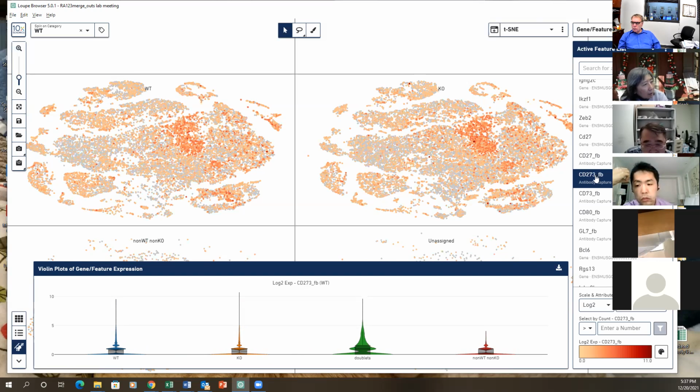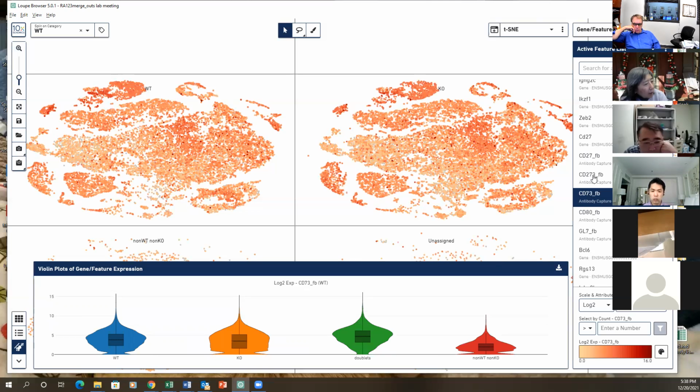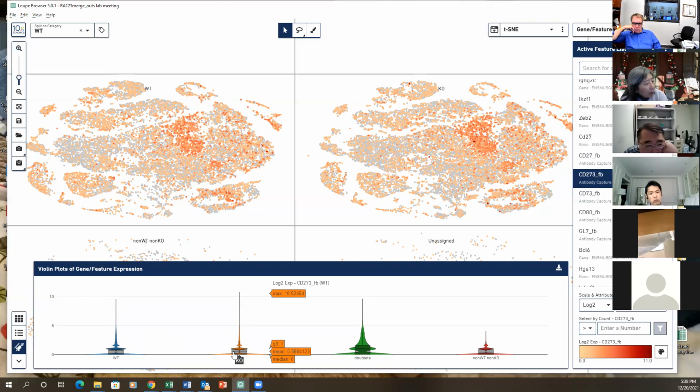I don't see a consistent conclusion. Only the memory, I think, is a consistent increase for the wild type, all of them. Okay, but anyway, that definitely gives a hint. The memory has more cell number in WT. Right, that's right. That needs to be more comparable. But in the 273, that's not the case. 273 is not good for macro analysis.